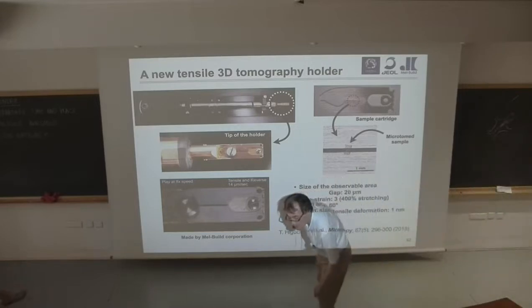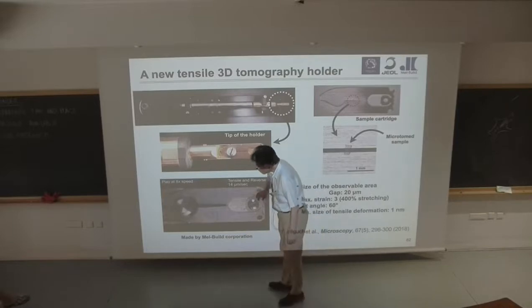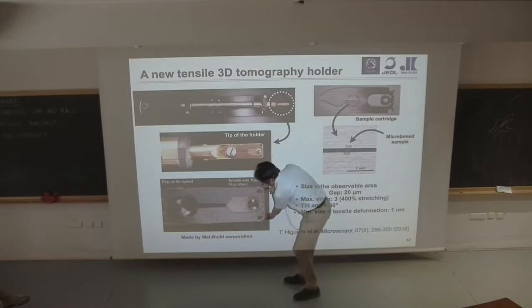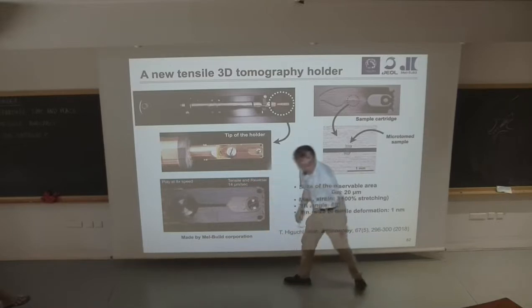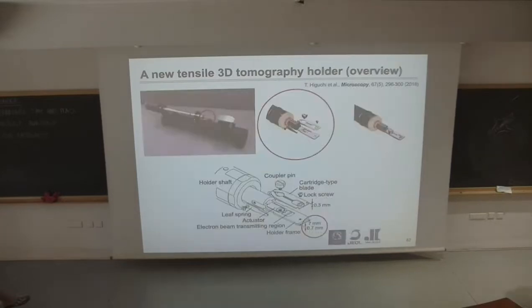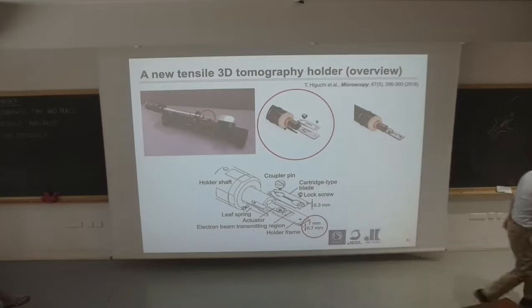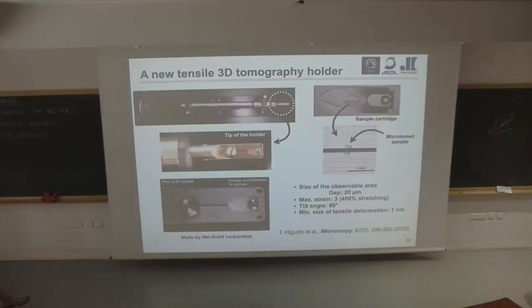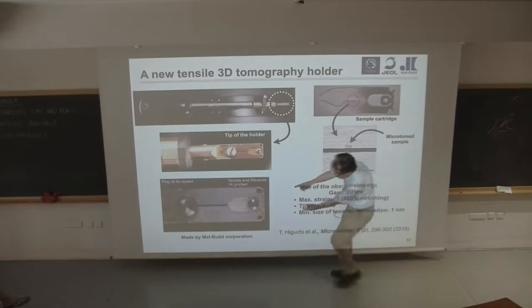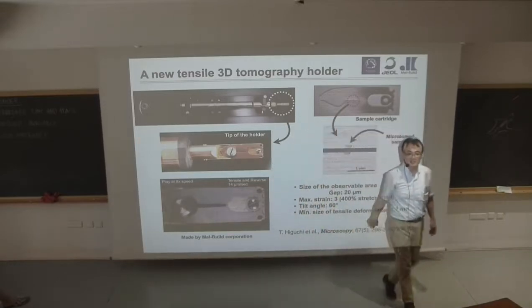What is the linear scale? How big are the screws or images or anything? Oh, the scale. For example, this one, the length here is 7 millimeters. So this is 7 millimeters. Okay, there's another one.